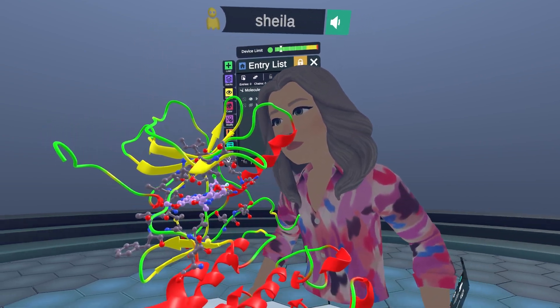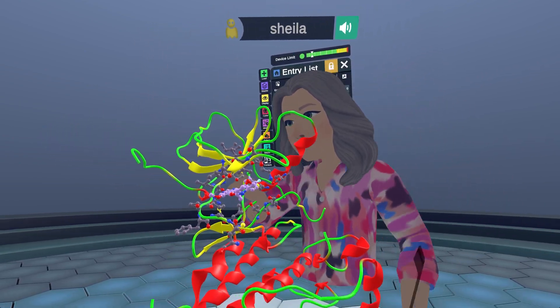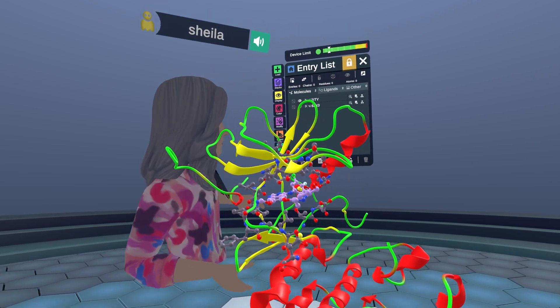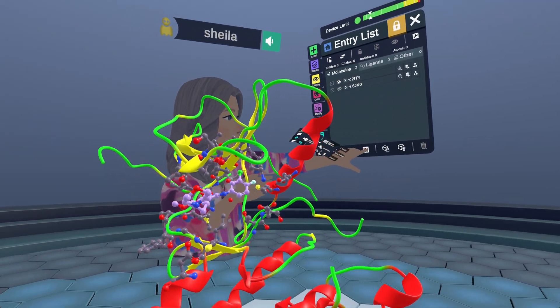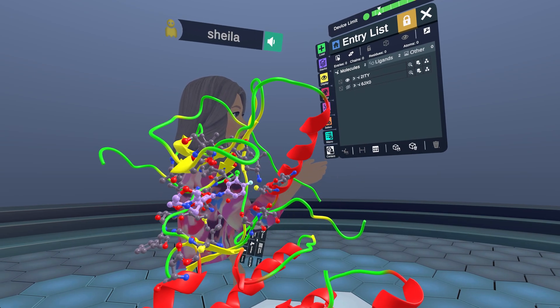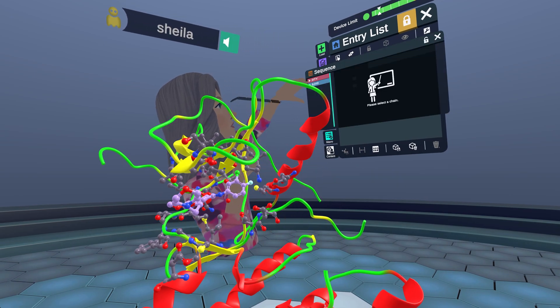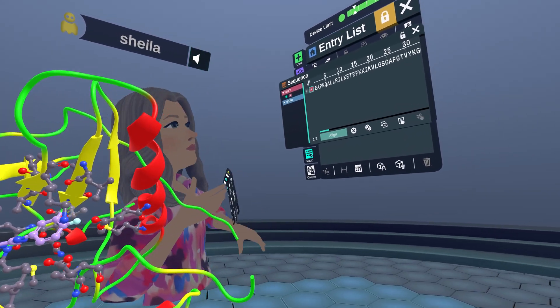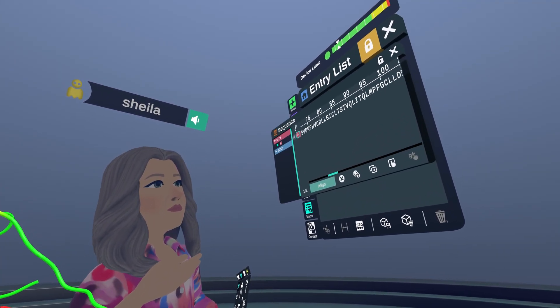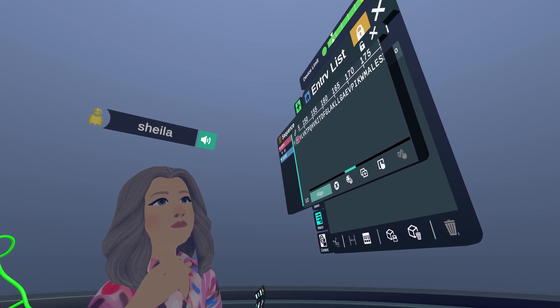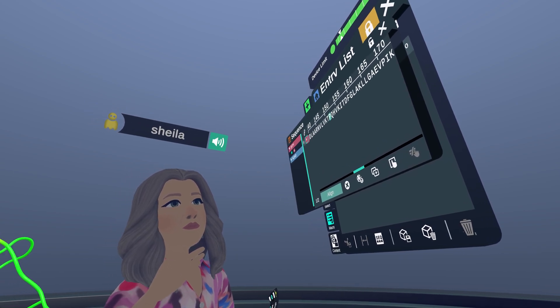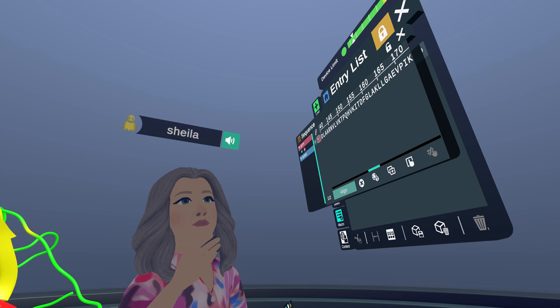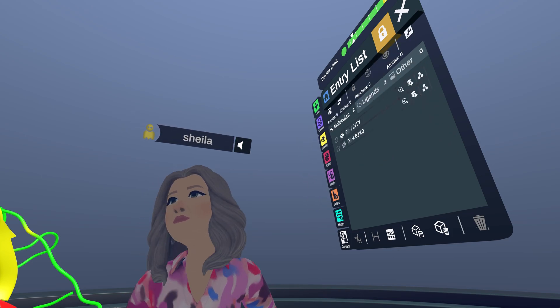I know I've been pointing to it, but I want to show you how you can find it if you don't already know where it is. One way to do that is by looking at the sequence menu at the bottom of the entry list. If I open that menu and select the protein and the chain, I can see all the residues scrollable through and I can hover over any one of them and see the residue number.